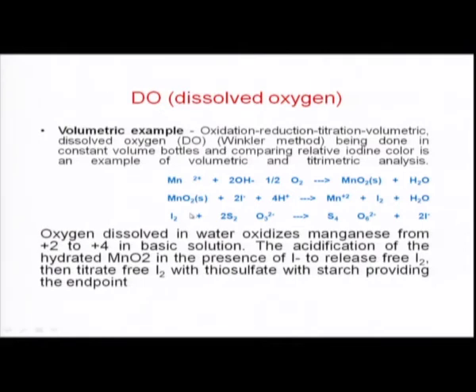Suppose someone wants to do it by BOD: the initial DO is measured, and after 3 days or 5 days of incubation, the final DO you measure will give you the measure of BOD, biological oxygen demand. So, the DO method serves as an important basis. BOD determination in wastewater is one of the important parameters, and it depends on the initial DO and the DO measurement after 5 days of incubation at 20 degrees, or 3 days at 27 degrees Celsius.